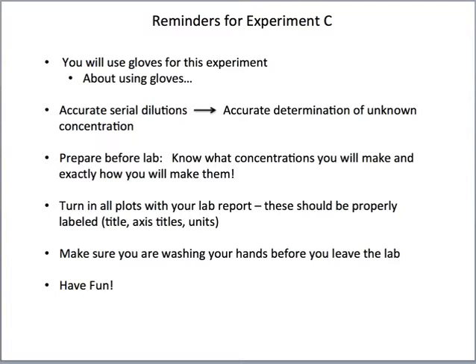Removing gloves: your TA will show you how to properly remove gloves at the beginning of lab. If not, ask them to do so. There's a special way to do that. But remember not to handle personal items with gloves on. It's not for writing in your lab manual. It's not for using your calculator. Gloves are for when you're handling chemicals. When you're not handling chemicals, remove them and don't handle your personal items, pencils, etc. with those on. And then, as always, don't have any cell phones or anything out in the lab.